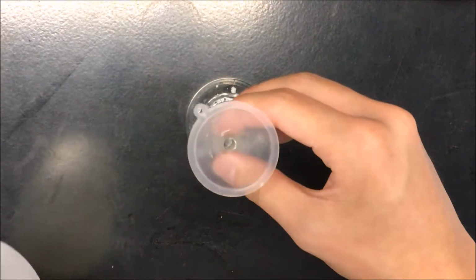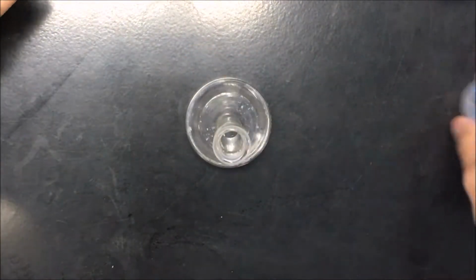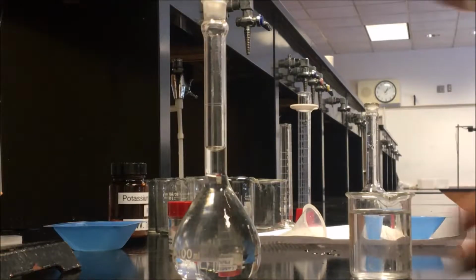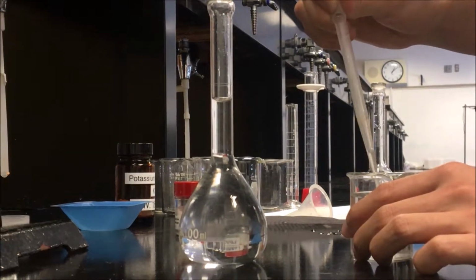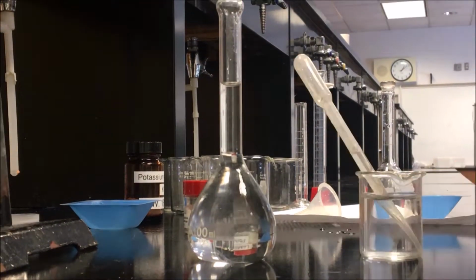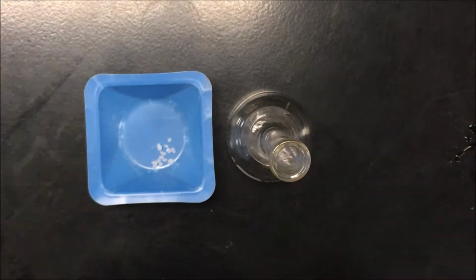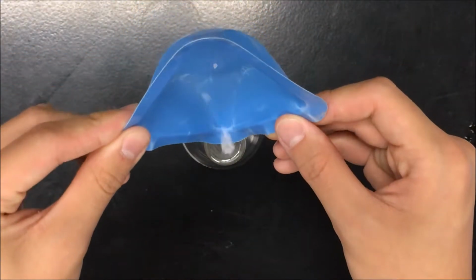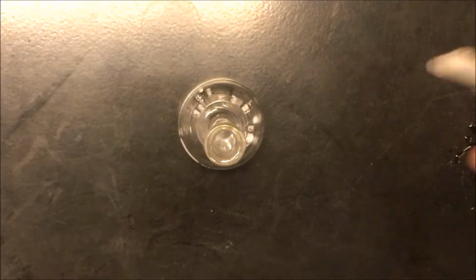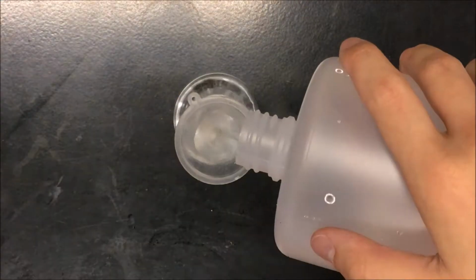Use a funnel to add water to the flask and make sure to mix constantly. At the end, take a dropper and carefully add water so the meniscus reaches the line indicated on the flask. Now, prepare the potassium iodide solution the same way you prepared the lead-2 nitrate solution. Make sure not to spill any of the compound while putting it into the flask.